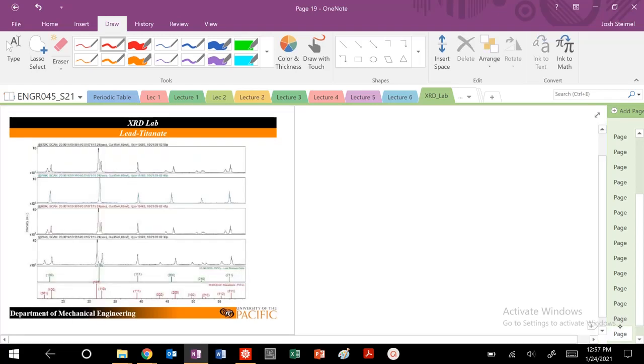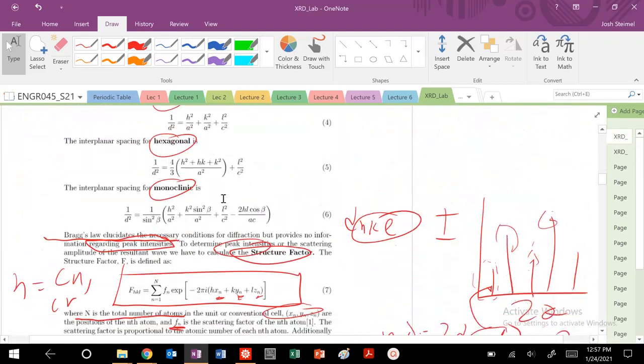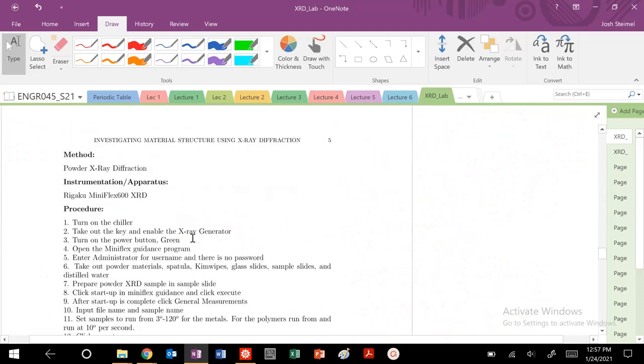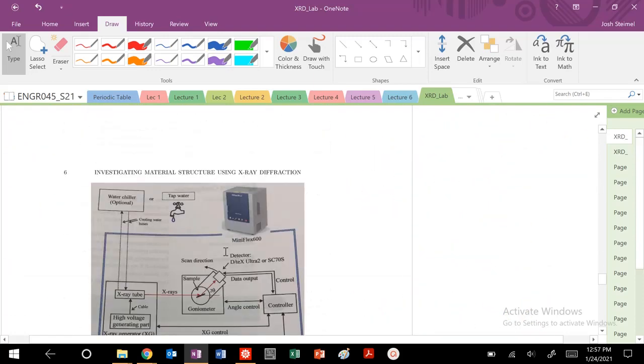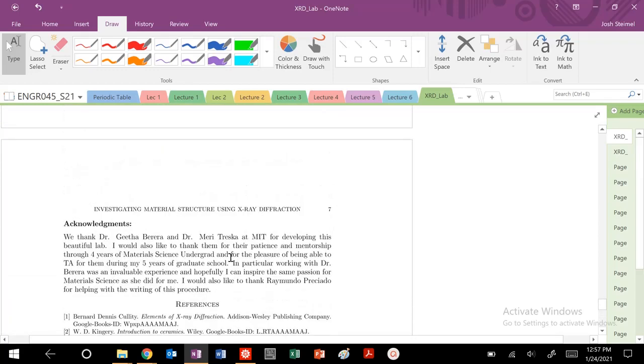That is a discussion, and you can see a different form of this as well. So remember, 2 peaks, 1 peak. Be sure to include that. That's the last part of the discussion in this lab. So discuss that, and you can start to see that's what's expected in this lab. So be sure to do all those things again.